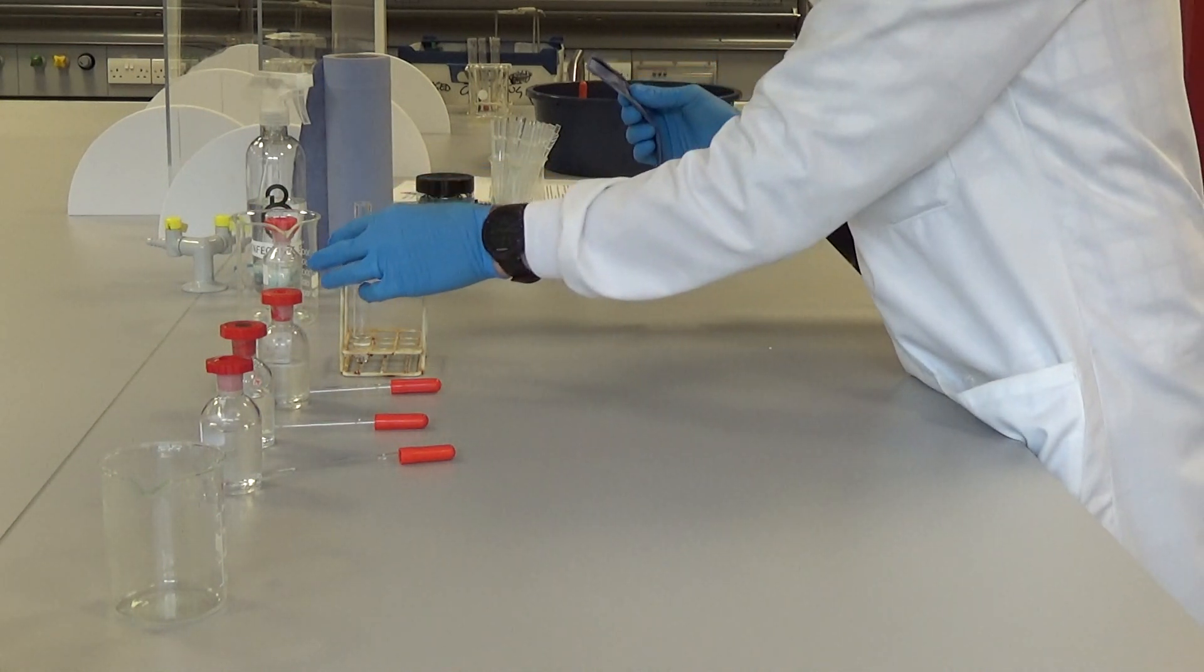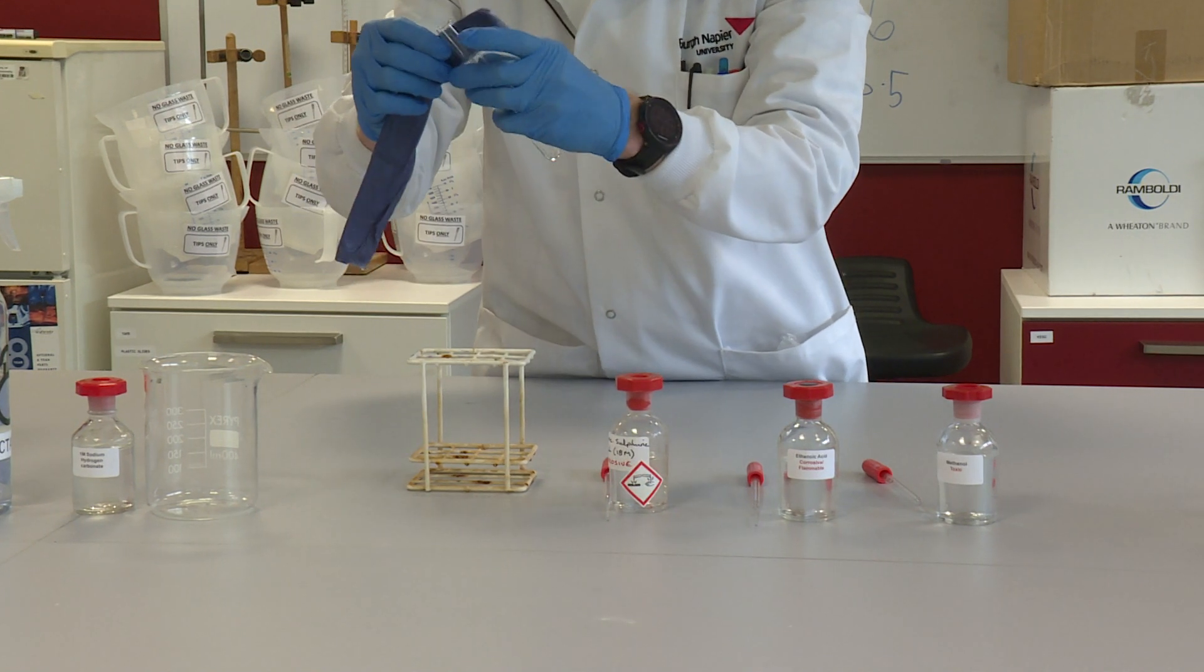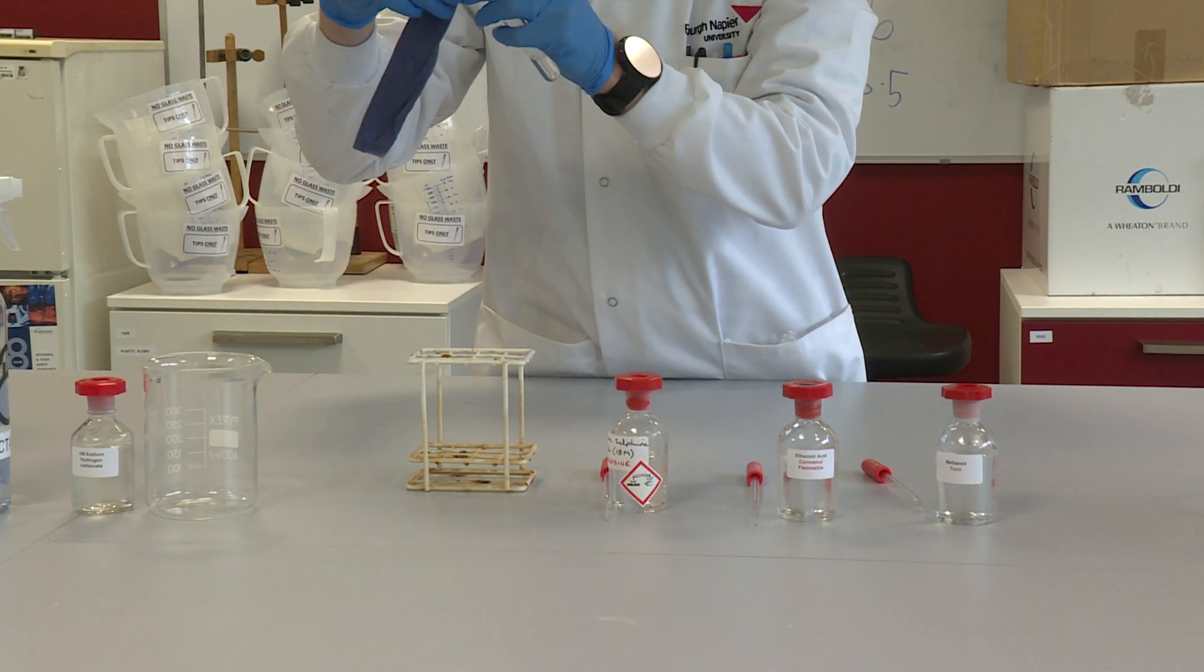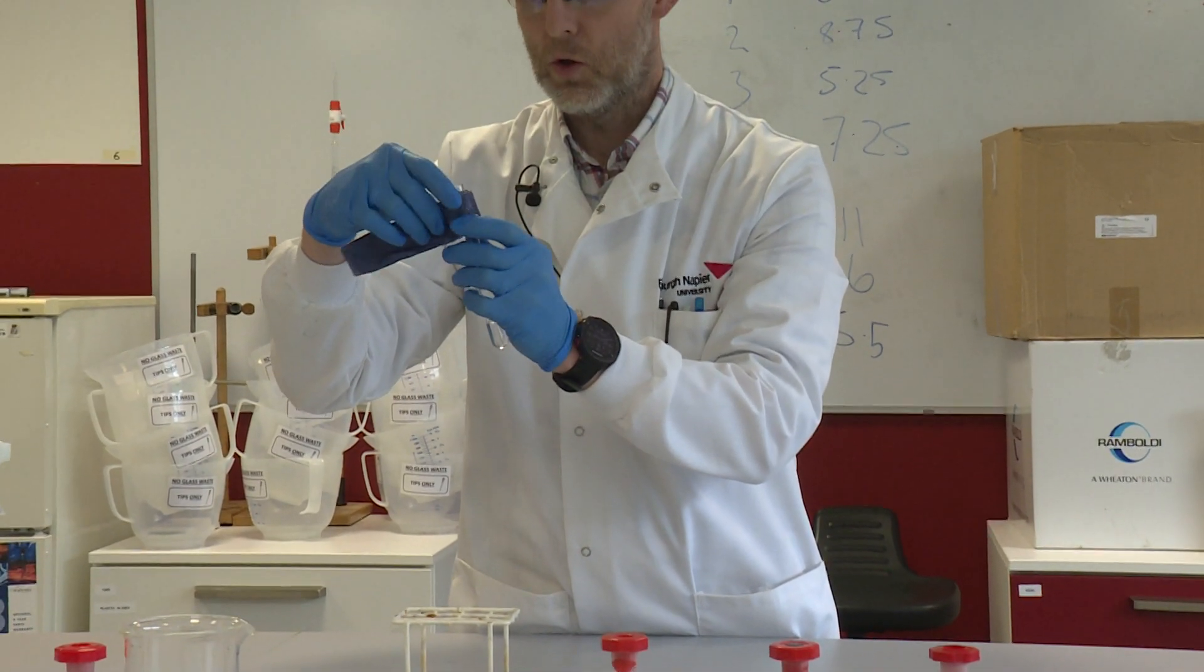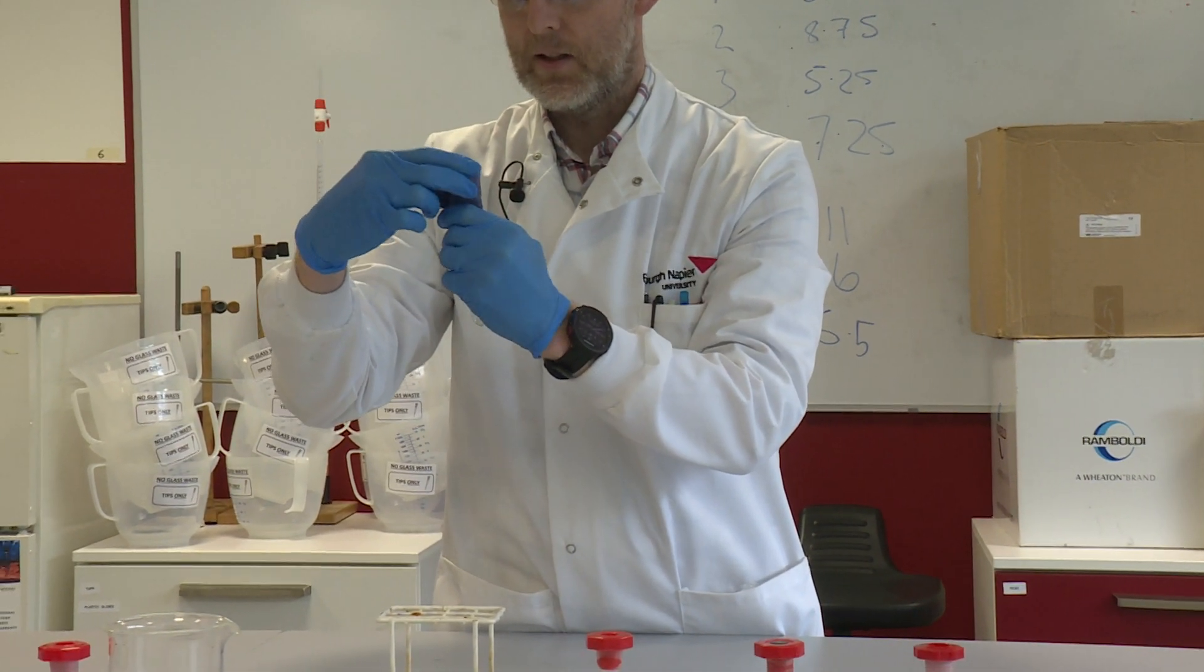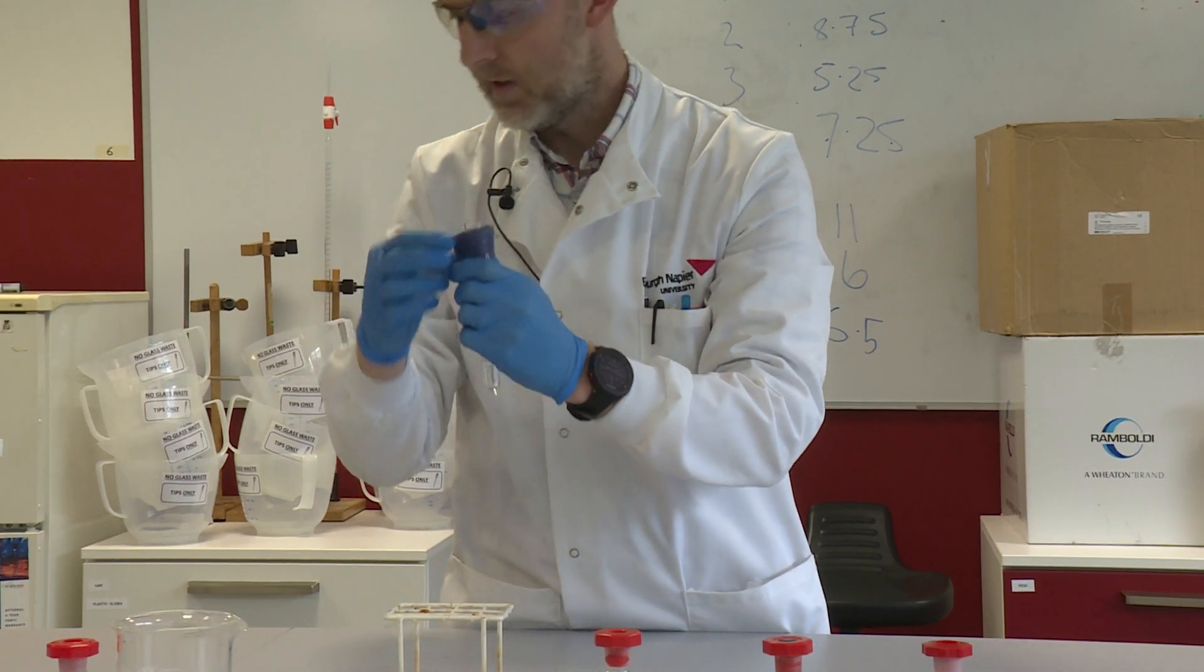What I'm going to do is just use a wet paper towel. I'm just going to wrap a wet paper towel around the neck of the test tube, which acts as a condenser. It keeps the neck of the test tube cold and will stop any vapor escaping.